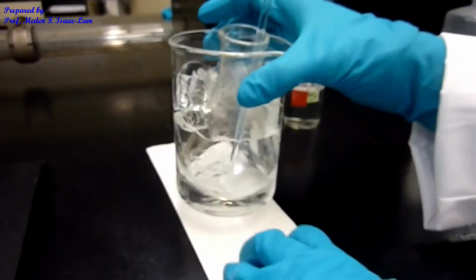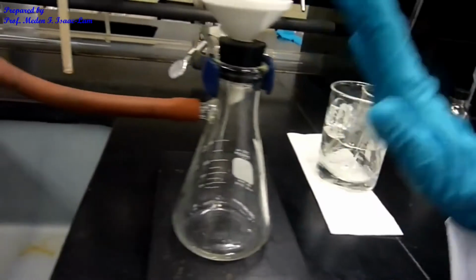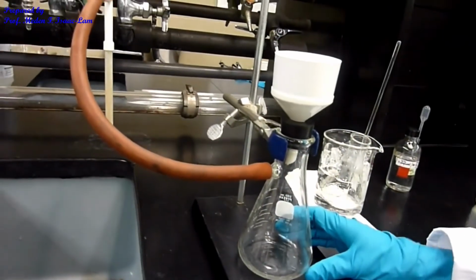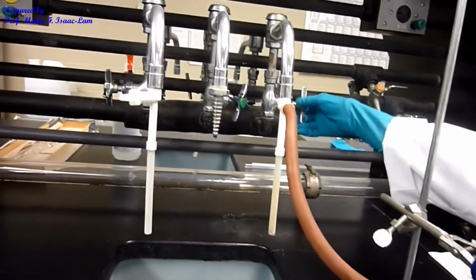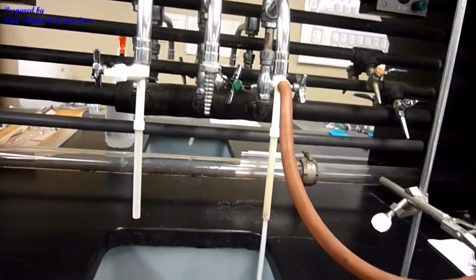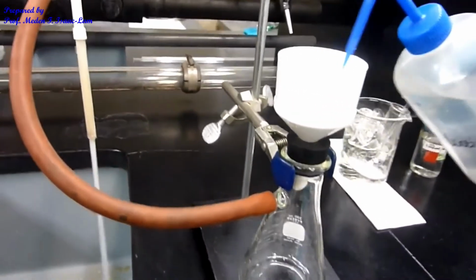So now we're ready to filter. Again, this setup: filter flask, and then attached to the water aspirator. And then I'm going to moisten the pre-weighed filter paper that we had earlier.